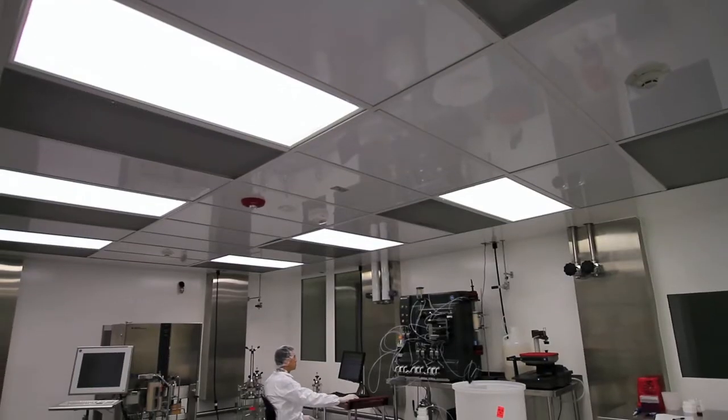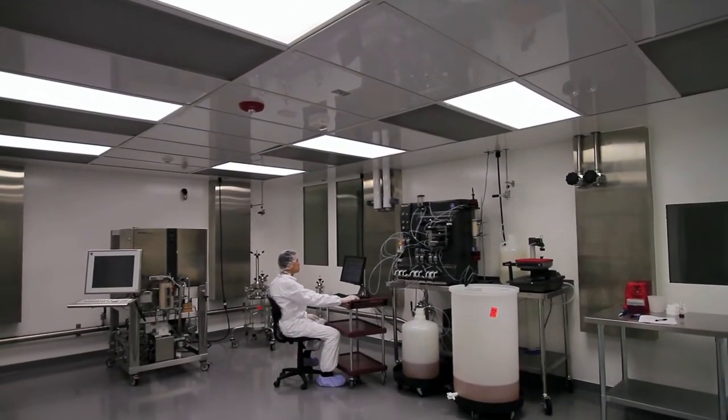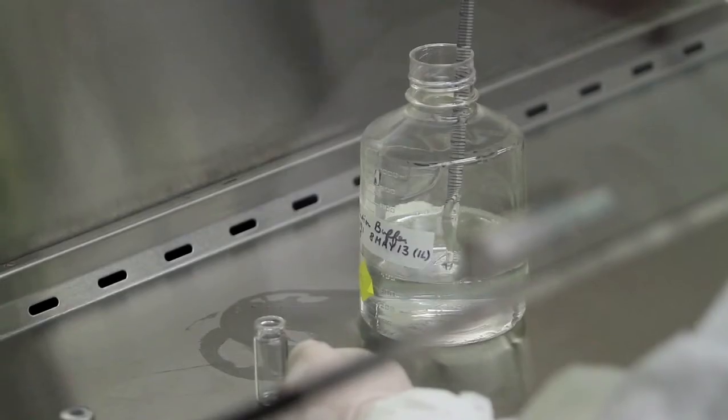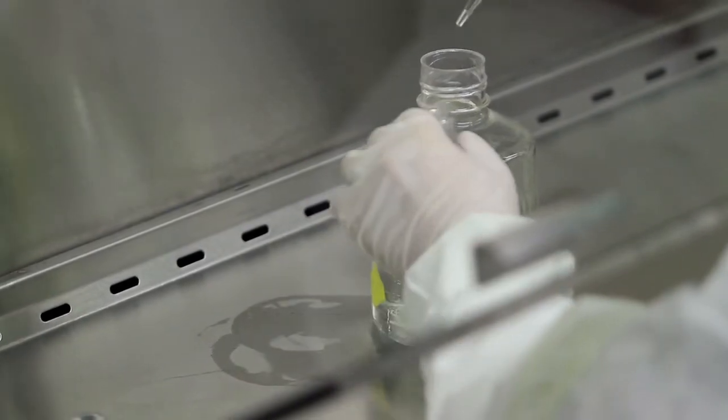The systems we're developing right now is that the pod is going to be able to sanitize itself using vapor phase hydrogen peroxide. The Rockwell control system will be programmed over the next year so that you punch a button when you leave at night and you'll be ready for the next patient the next morning.